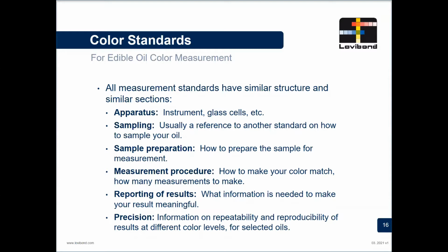And then we have some stuff about sample preparation. How do I prepare the sample? Is it cloudy? Do I need to heat it? Do I need to filter it? And then we have the measurement procedure. How am I actually making the measurement? How many measurements am I making? Do I have more than one person make a measurement? You know, how can I be certain about what my measurement is, basically?